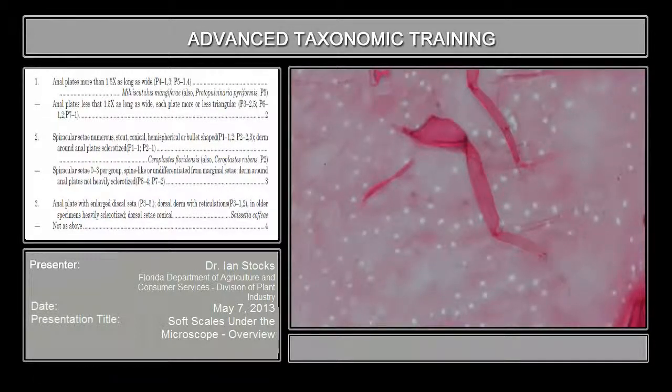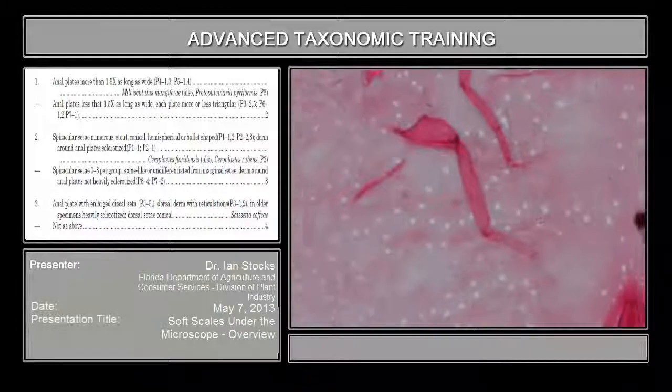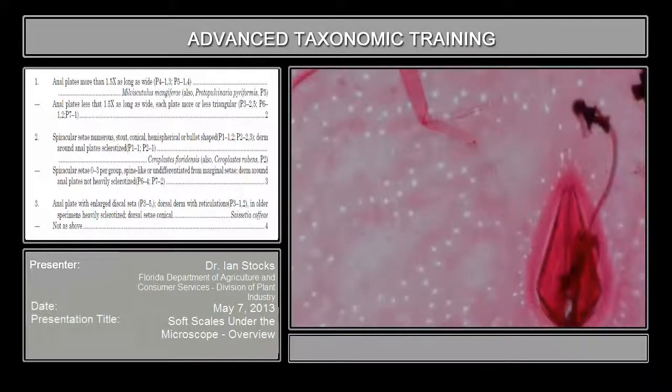As we did for the mealybugs, you can go to the segments. This is the coxa here, the first segment that articulates with the body surface. The next segment down is the trochanter. Then we have the femur. The tibia here. And then angling down is the last segment with the tarsus. And that ends in the claw.